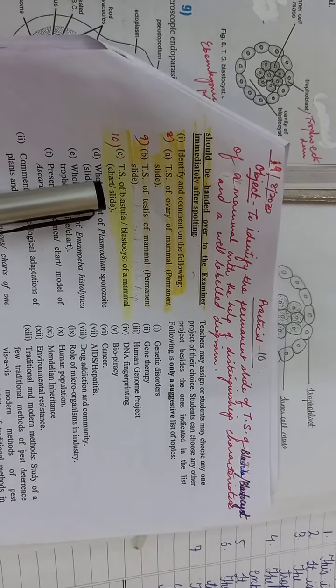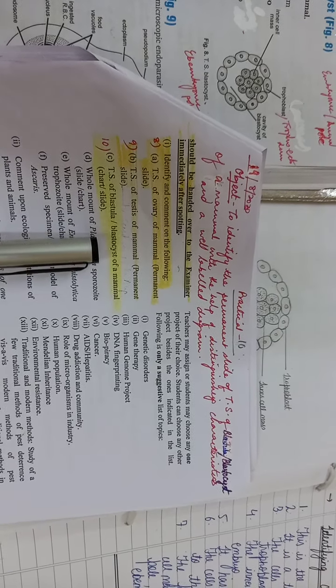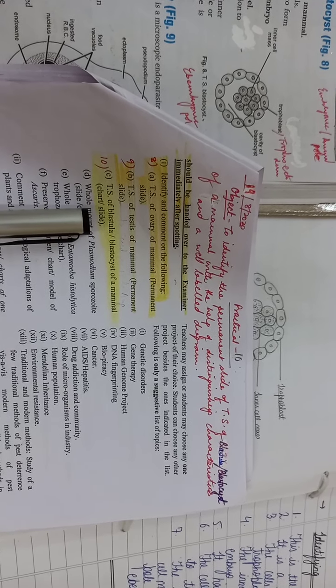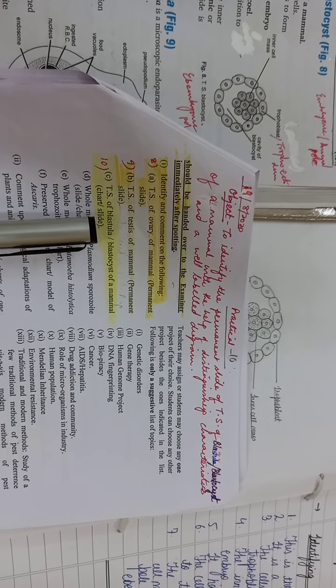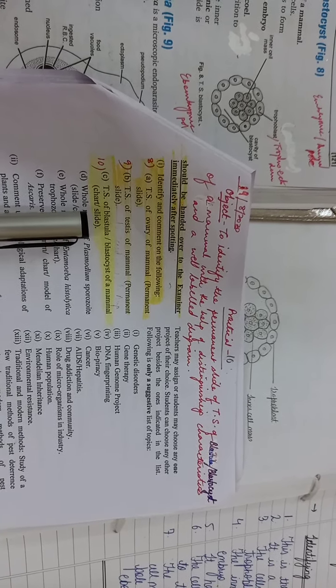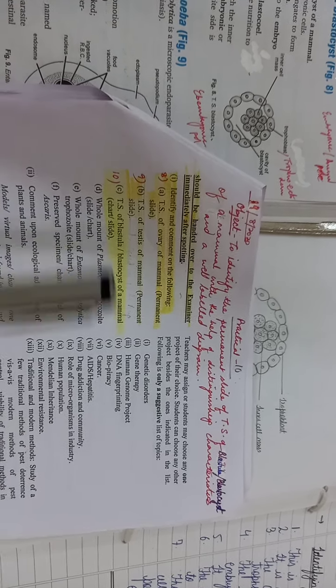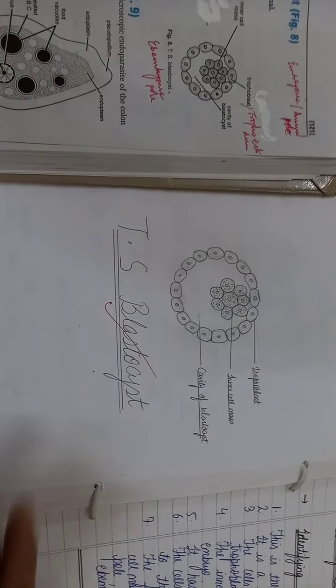Now, see, in your course, the option is given the TS of blastula or the blastocyst of a mammal to be studied by means of a chart or a slide. So, we are adopting the method of a permanent slide, so that whenever the school reopens, we'll be studying the practical with a permanent slide. So, let us see how to begin. Your work is very simple.